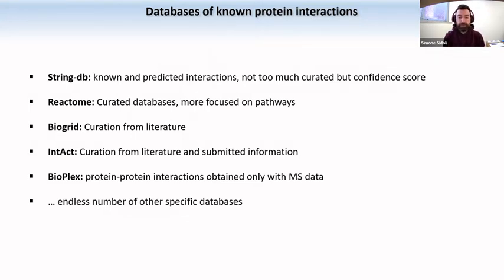Right? So when you do a proteomic experiment, you come out with a list of proteins that are enriched, but the real question is, do these proteins have anything to do with each other? Your single experiment does not give you that answer, but you can use the immense literature that we have to at least start clustering proteins in groups, grouping them with each other.